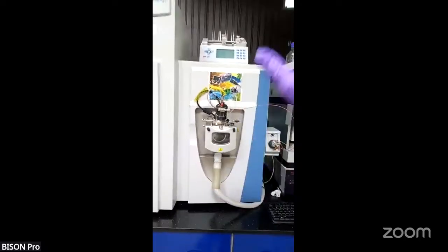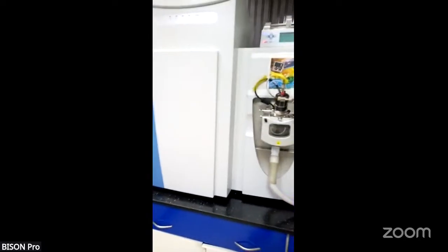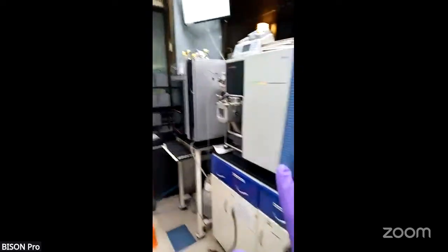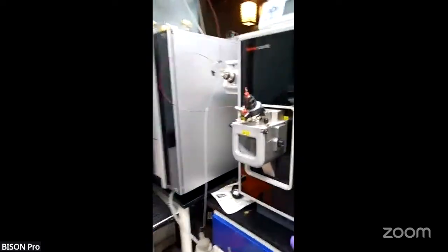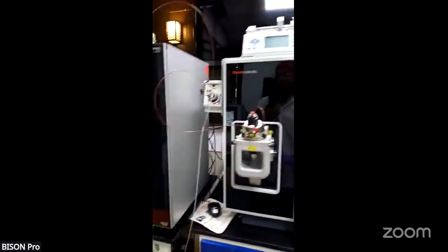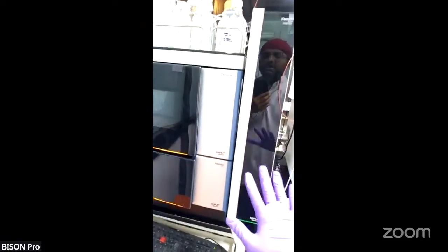Once you have identified what proteins and what metabolites are there in your sample, we can go to another mass spec which is specialized, the triple quadrupole, or the TSQ Altis. Here you can see this instrument is the TSQ Altis, and this instrument is a Vanquish, an advanced version of the HPLC.